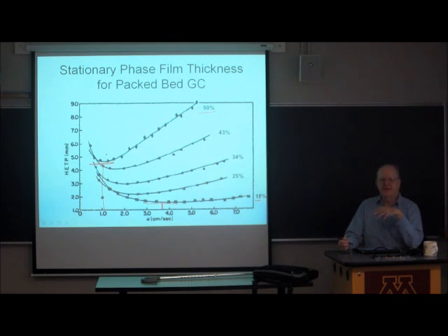Clearly, the stationary phase loading, the percent by weight of stationary phase, is an important parameter in gas chromatography. There's a trade-off between this and this.